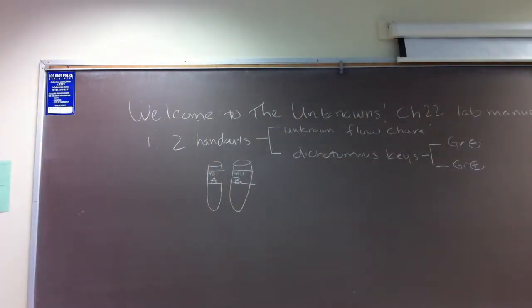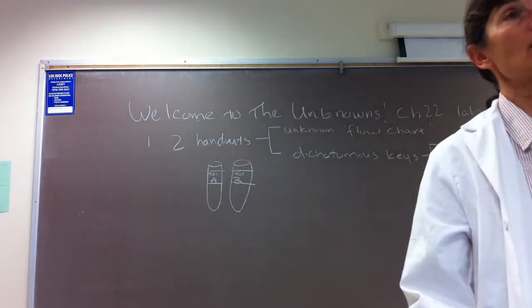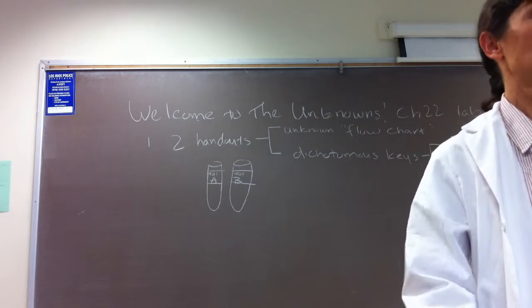We have uses for plates that might not be perfectly sterile, okay? But please don't use it for yourself. And most important, you guys, don't put it back. Because the presumption is all these plates are sterile, and you don't want somebody else to get messed up because of a contaminated plate.